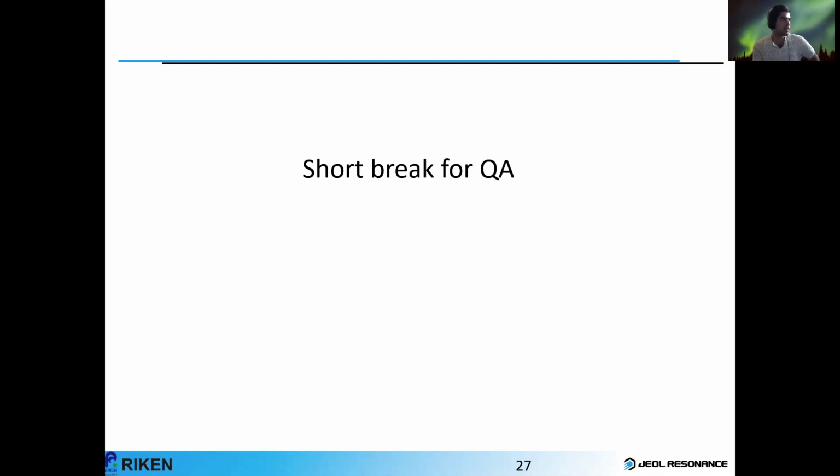So the first question is, does chlorine actually benefit from MAS? I was under the impression that chlorine spectra are only useful if static ultra-wideline experiments are performed. Professor Bryce has already answered with this comment that it depends on the size of the quadrupolar interaction.